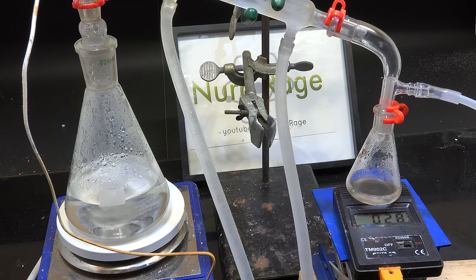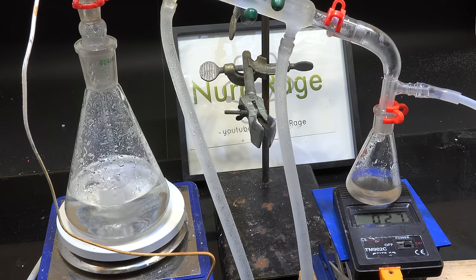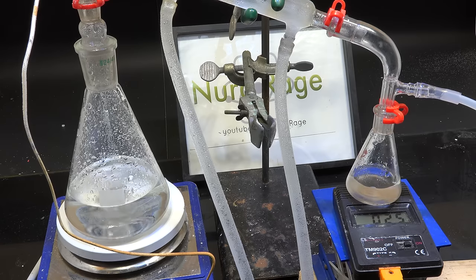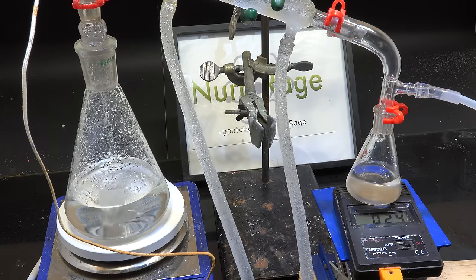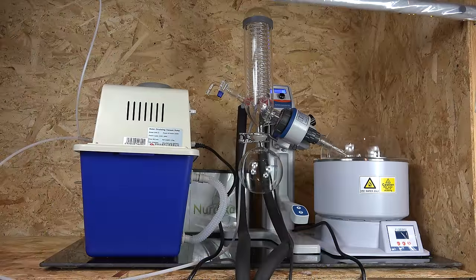Vacuum drying may be absolutely necessary for substances that are too sensitive to heat for conventional boiling. But setting up a vacuum distillation apparatus every time you want to remove solvent from a product is itself time consuming. So it would be great to have a completely integrated piece of equipment for solvent removal using vacuum distillation with minimal labor and time. And that is what a rotovap is — it combines the various processes of vacuum distillation or low pressure evaporation to quickly remove solvent from products.